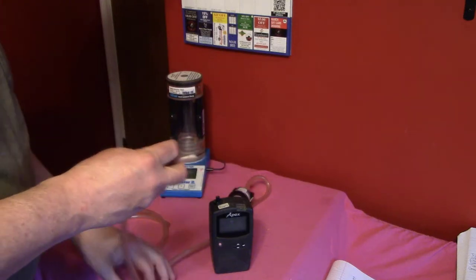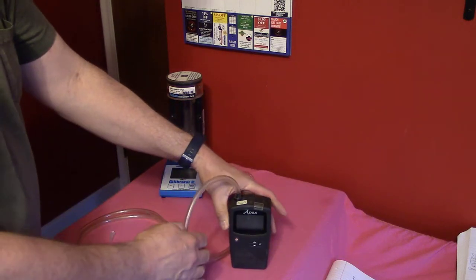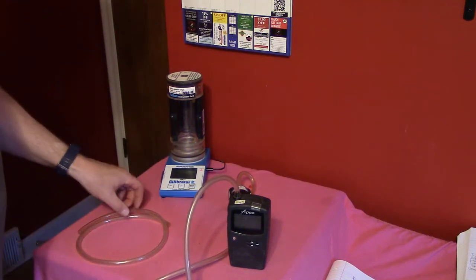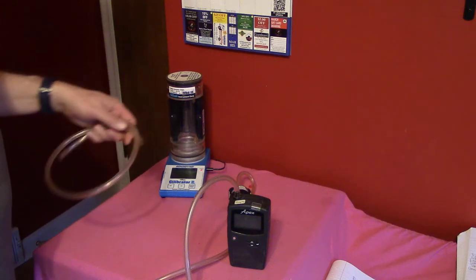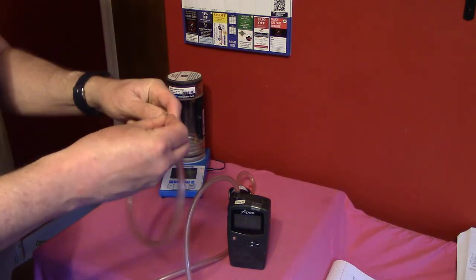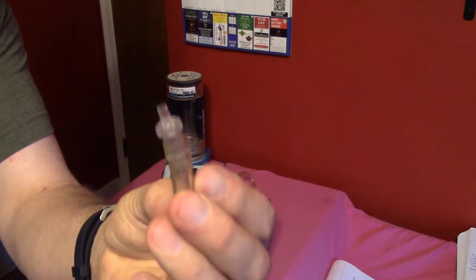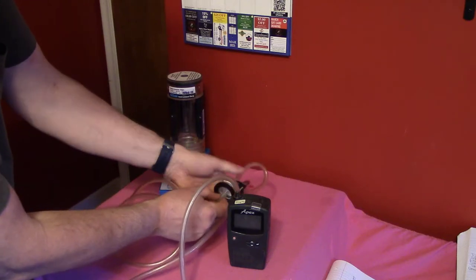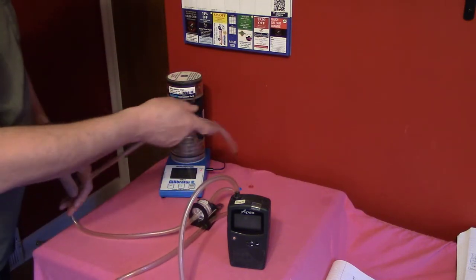I'll connect the tubing to the inlet of the sampling pump. Next I'm going to connect the inlet of the filter to the outlet of the calibrator, putting a tubing connector into the tubing, inserting that connector into the inlet of the filter, and then connecting it to the outlet of the calibrator.